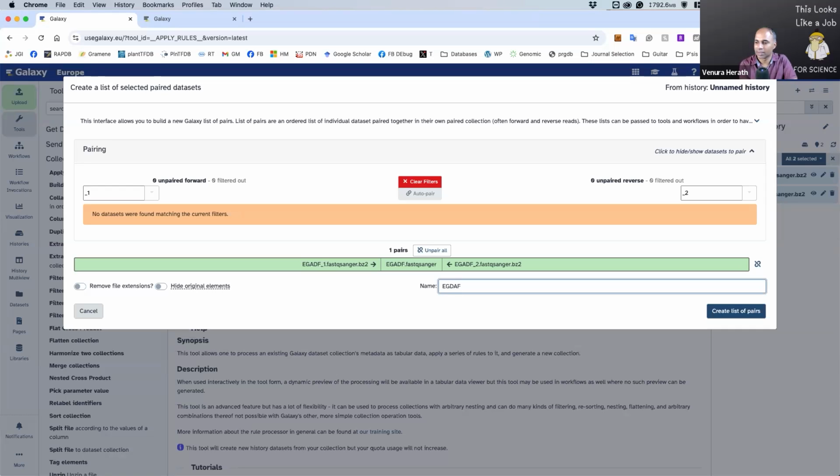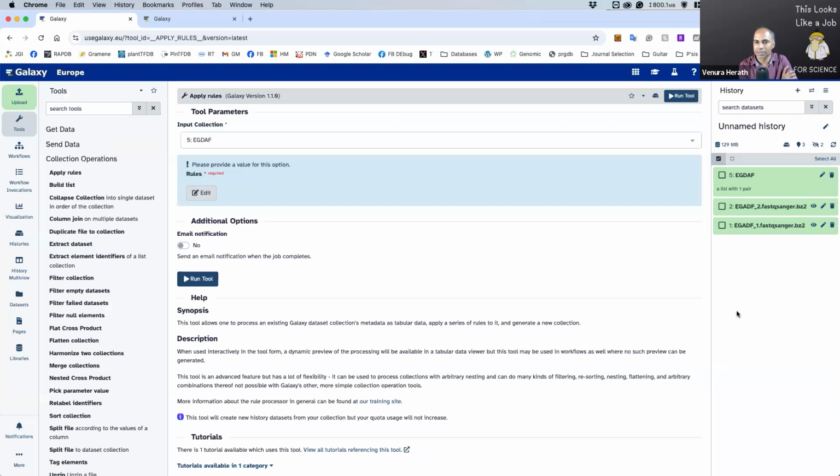Okay. So any issues? I assume there are no issues. So what I'm going to do is create a list of pairs. Okay, so now you have a pair. Now we can move forward. I hope all of us are on the same page, in the same step. Let me bring back the presentation.